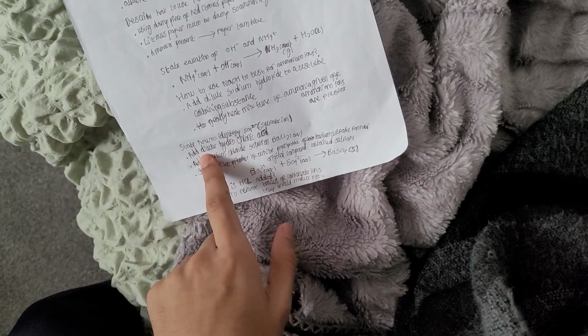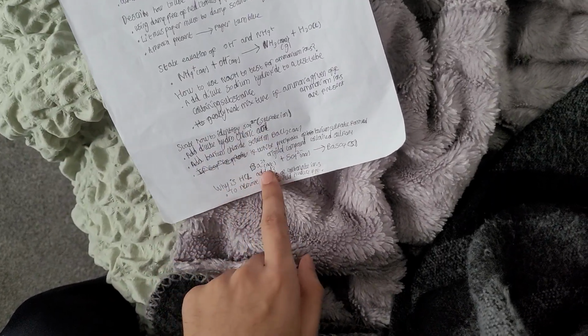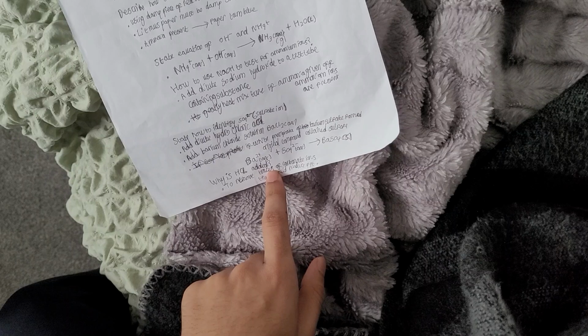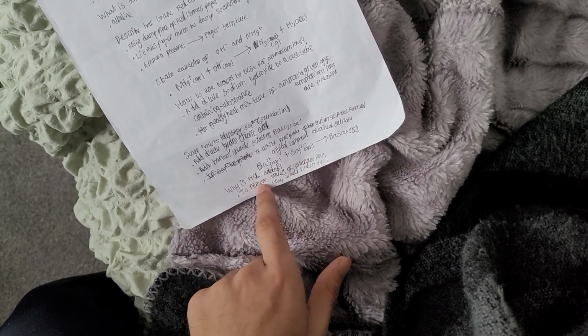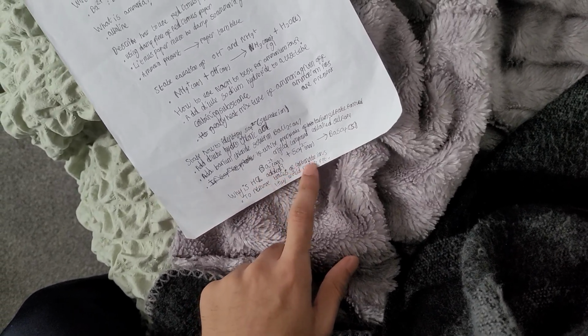Why is dilute hydrochloric acid added? Why is HCl added? To remove traces of carbonate ions, as they would also produce a precipitate. HCl is added to remove traces of carbonate ions, as they will also produce a precipitate.